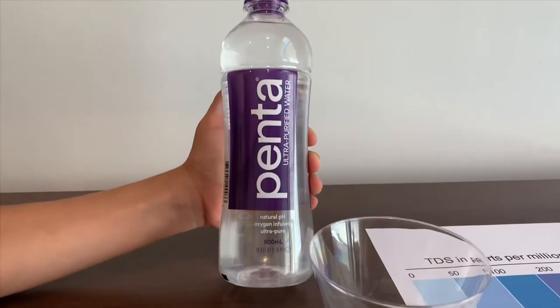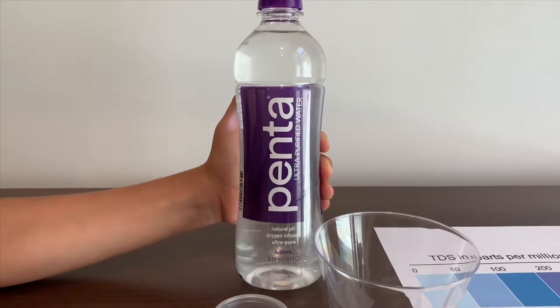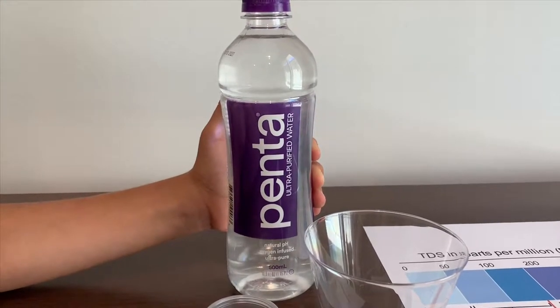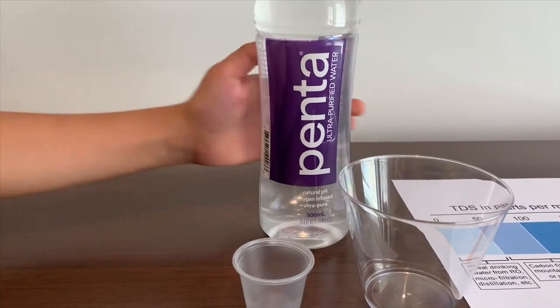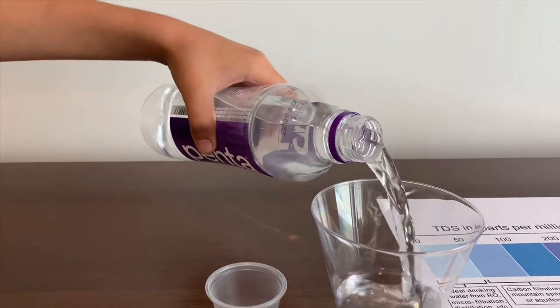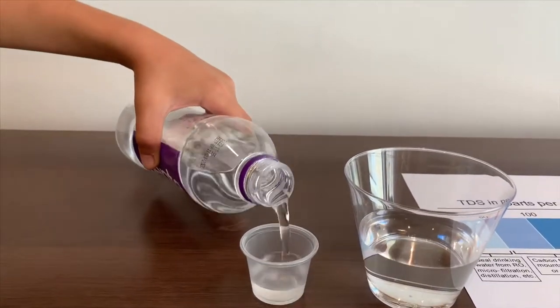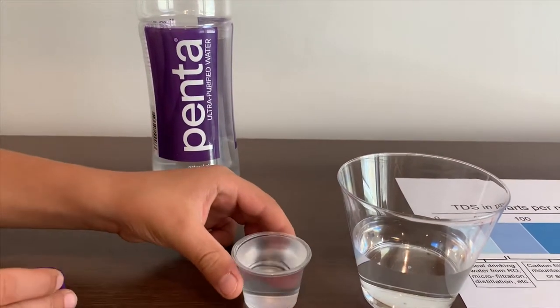This is Penta Ultra-Purified Water, naturally pH 8 oxygenated, ultra-pure from San Bernardino. Now let's put some water in. Too much — we need to put half.